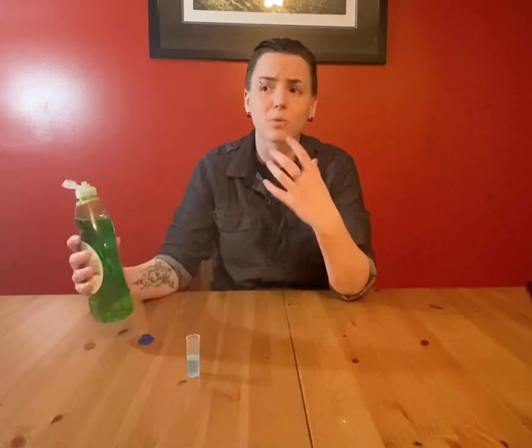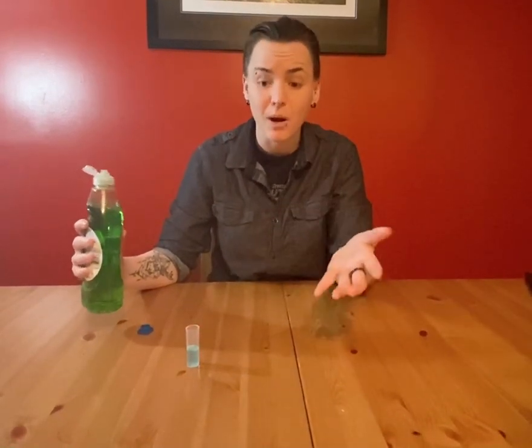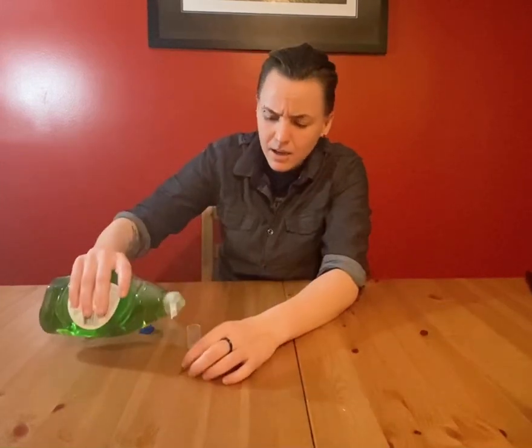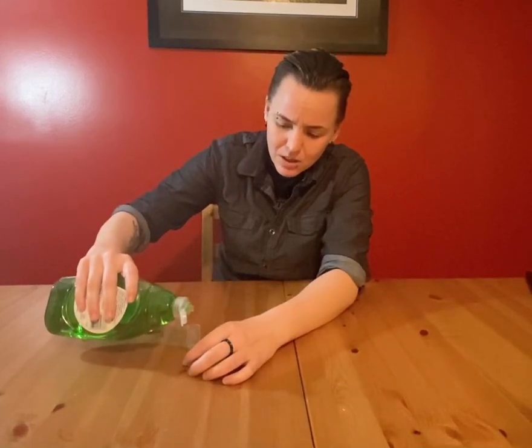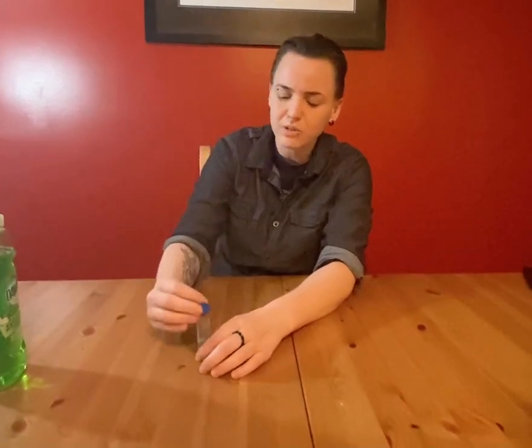That's also why sores in your mouth end up healing way faster than a cut on your arm, because your cells are able to heal 4 times faster in your mouth. So, interesting fact. Now you're just going to take some dish detergent and put it inside of this, and then close the cap.